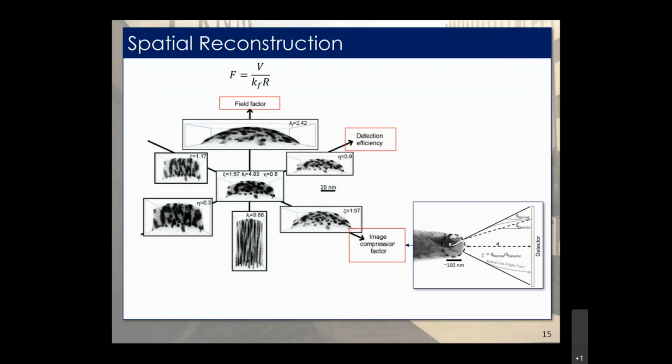You never have an atom that's completely rearranged with respect to the other atoms. And because of that, if you wanted to know, for example, the composition of the precipitates in this material, you could get that from any one of these reconstructions, because the composition, which is essentially a binning of a phase and counting the atoms within it, isn't going to be changed by different distortions of it spatially.